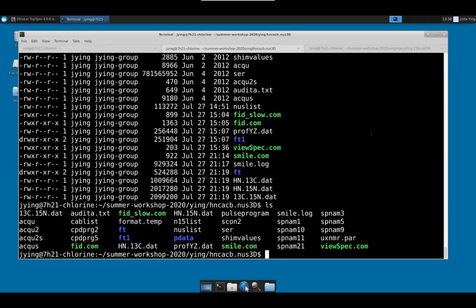And I tell you what, sometimes it's a false alarm. A lot of the time it's really when your receiver turns on too quickly after the pulse, it still has some of the junk in the probe that it can pick up, and it particularly happens for cryoprobes. And in that case, you can set the DE time, the dead time delay, to be a little longer.